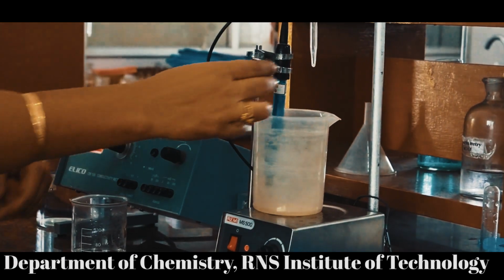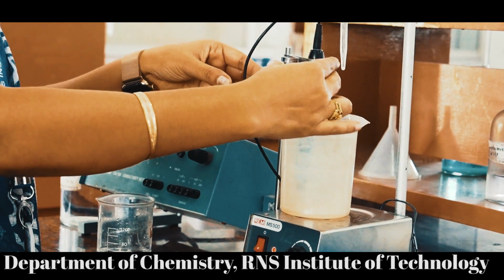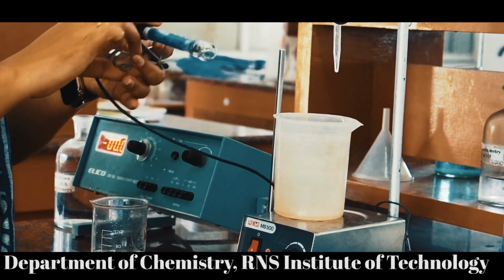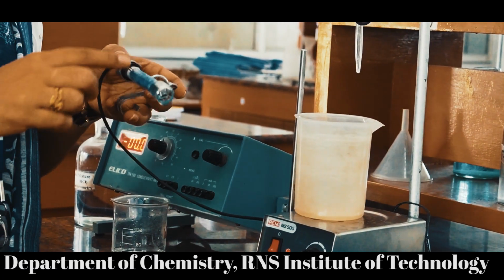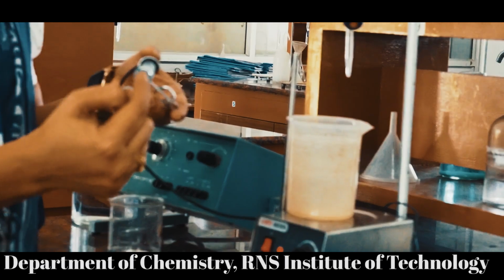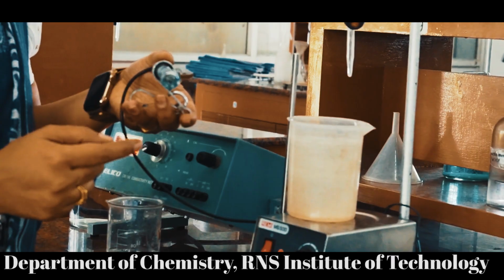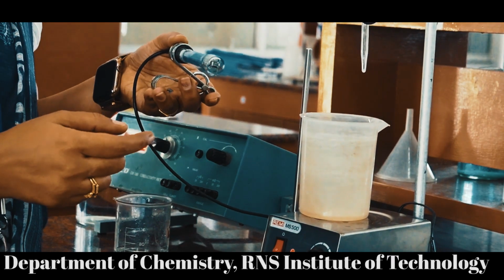So the third step is washing the conductivity cell. It will be like this, just a bubble type. I have told you that today we are going to measure the specific conductance, so this type of conductivity cell we are going to use. It is a glass vessel with 2 small platinum electrodes, coated by platinum black, separated by around 1 centimeter.